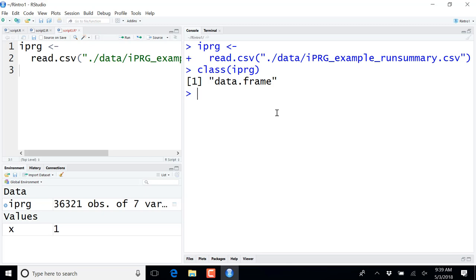And I'm going to call that vector, what am I going to call it? I'm going to call it log2 intensity. And let's imagine I have a third vector that has exactly the same number of elements, and I'm going to call it rom, and so on. Now these are still vectors, so that the protein vector is a vector of characters. The rom vector is also a vector of characters, but the log2 intensity vector is a vector of numbers. So what I'm going to do with all these vectors is I'm going to paste them next to each other like different columns of a spreadsheet to give me a data frame.